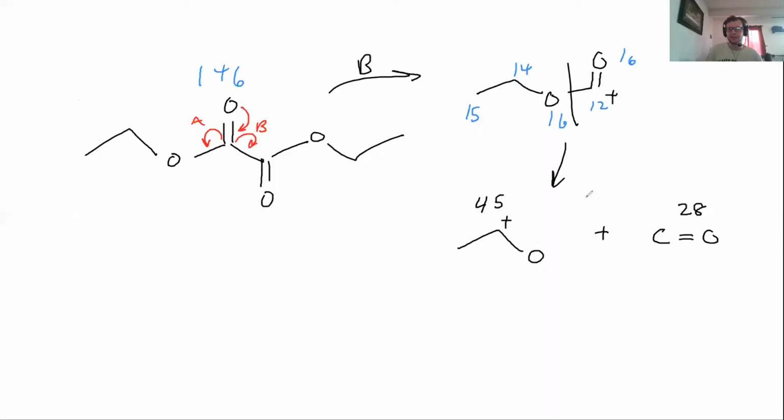So now back to here, this guy could split more. Out of this guy, we can get an acetylene. Actually, in this case, it's not an acetylene. It's kind of like a methylene guy. So let's see. We've got our three hydrogens right there, and our three hydrogens right there.